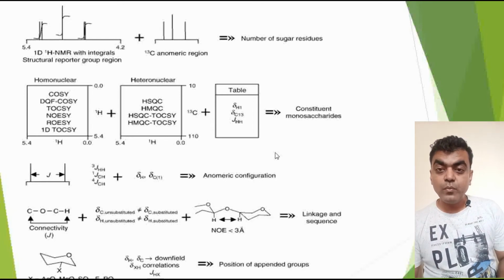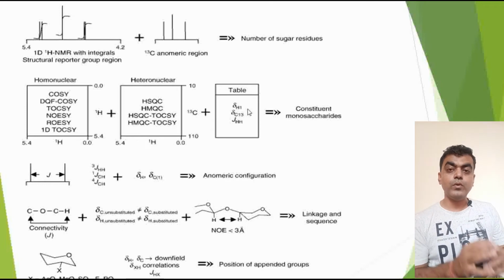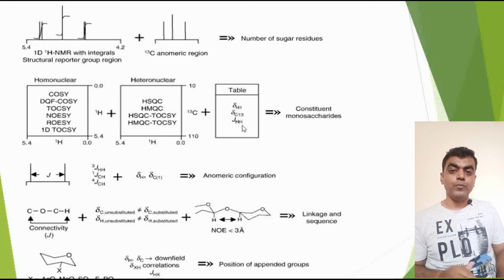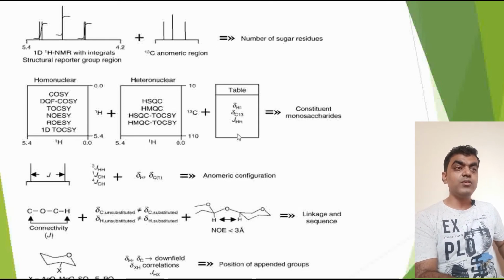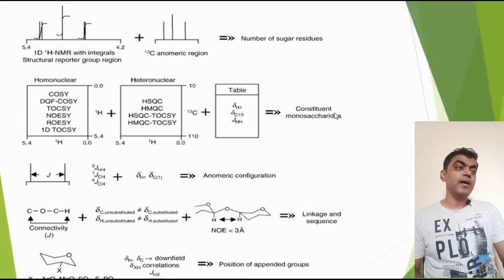And this data, along with the previous data, you are putting down in the form of a table. So in the table, we know the chemical shift that is given in delta, that is for the proton. We know the chemical shift of carbon, that is again in C13, and then comes the final J value of the spin-spin coupling. The spin-spin coupling will only happen with the protons, it will not happen with the carbon, because carbon is the backbone. You will have only the side chain of the protons, and they will have the spin-spin coupling. So matching the J values, once you do all this rigorously, then you can come up with the final configuration.